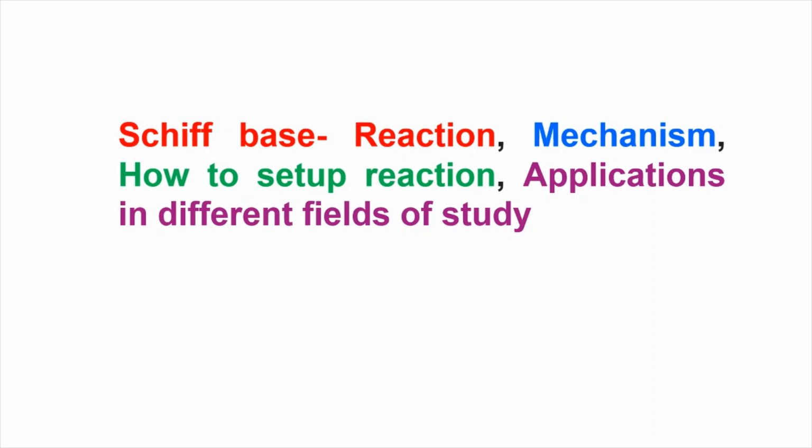Here I'm with a new video on a Schiff base reaction. I'm going to go through a little background, reaction mechanism, reaction setup, and some interesting applications of Schiff bases in different fields of chemistry like material chemistry, drug delivery, and catalyst activity. So let's start. Please watch the full video. You will definitely get something from this video. Let's start.